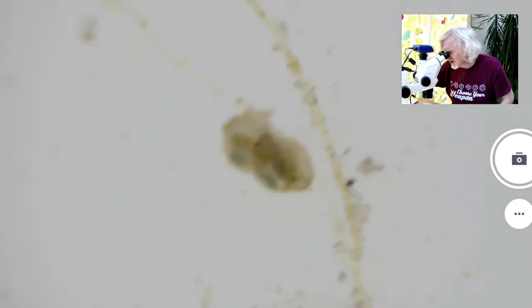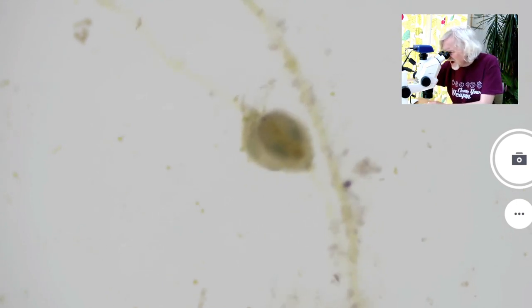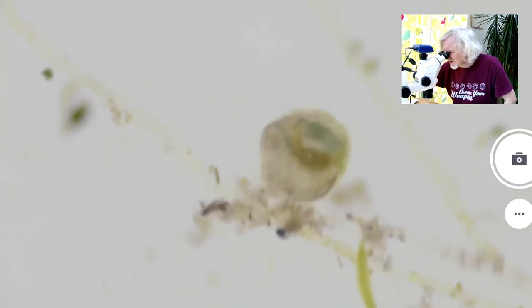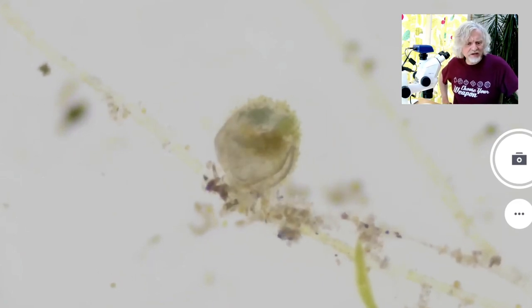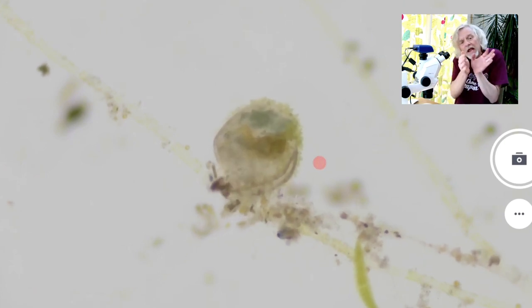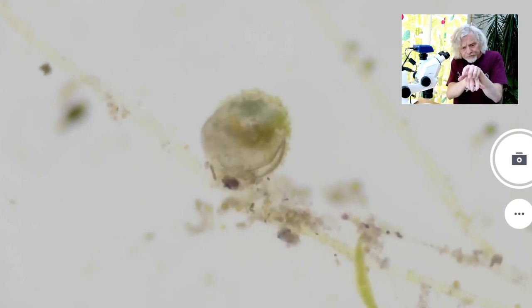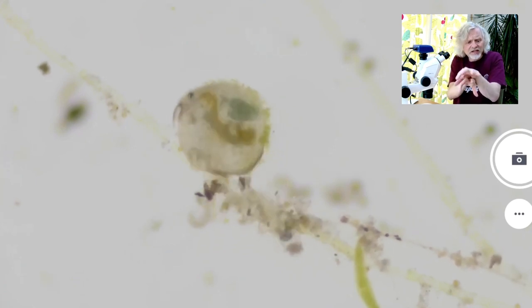And then what I'm going to do is I'm going to try and zoom in on one. I'm going to find some that are not moving around too much. I've deliberately put a couple of bits of... I'll try and make sure I'm really well focused. Because these are jolly diddy. Those aren't very interesting because they're showing their backs to us. Let's zoom in on that one. There is a tiny little ostracod.